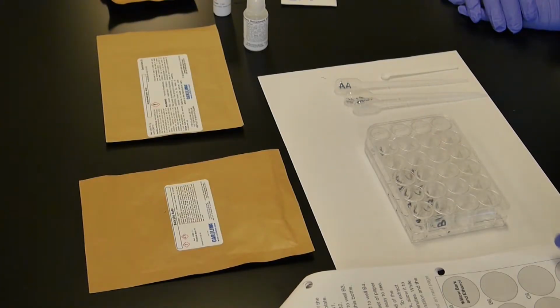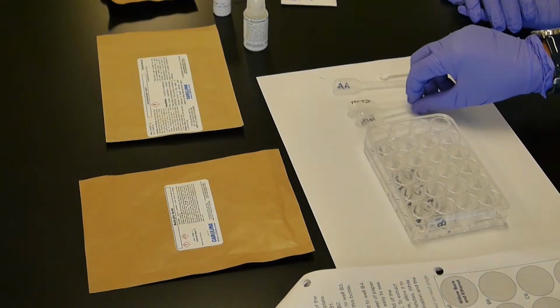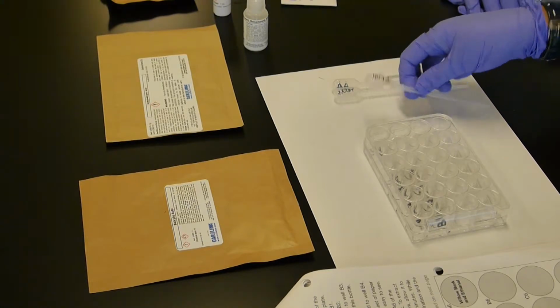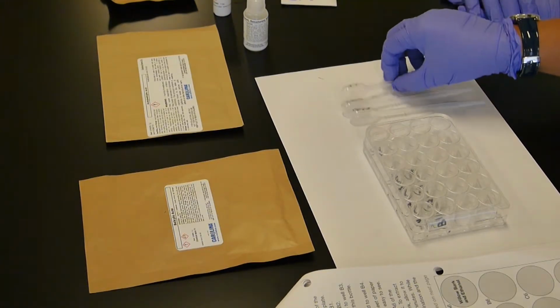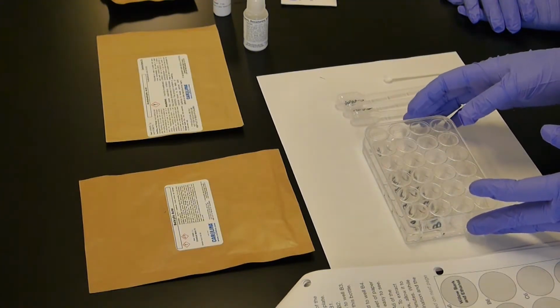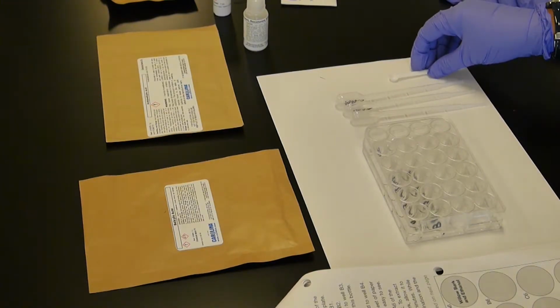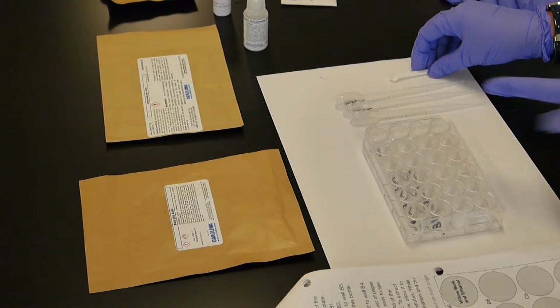Add the chemical reagents as mentioned in the lab. We have here the well plate, which I have labeled just as it is presented in the lab, and I have labeled the pipettes, one for ethanol, one for iron chloride, one for acetic acid. What I'm going to do now is take all of the reagents one by one and add them one by one into the well.